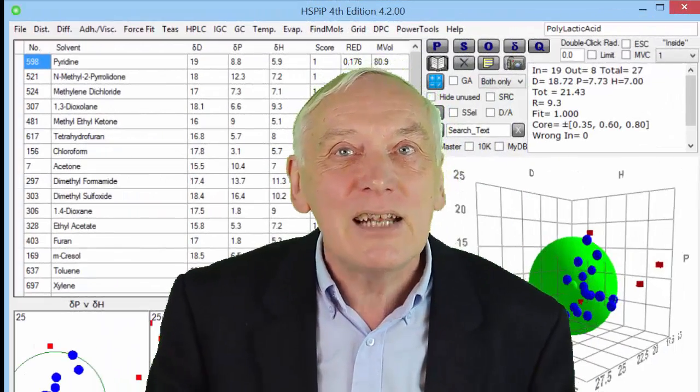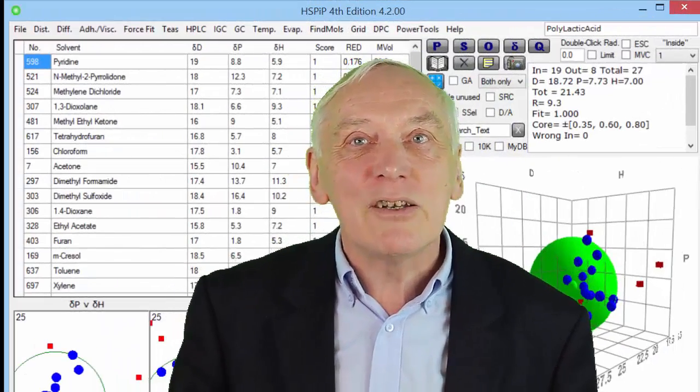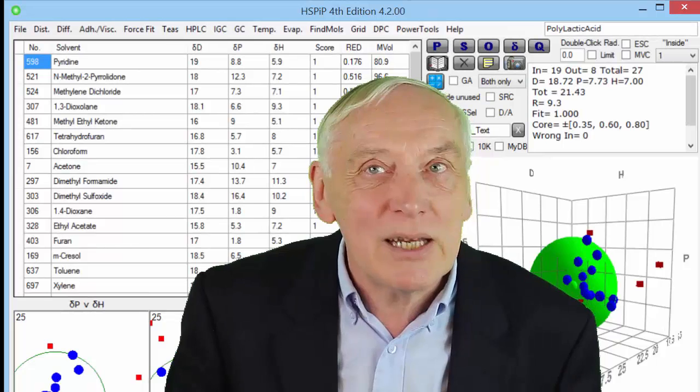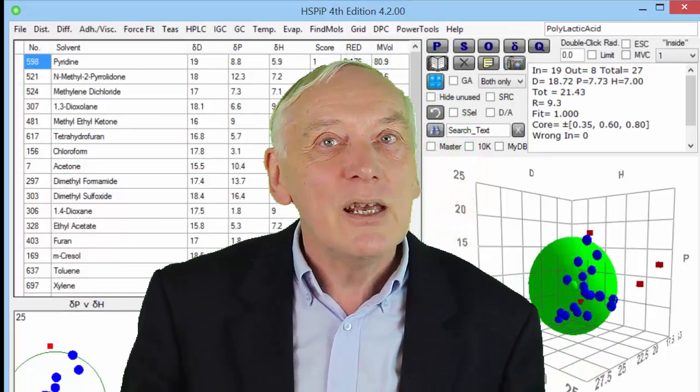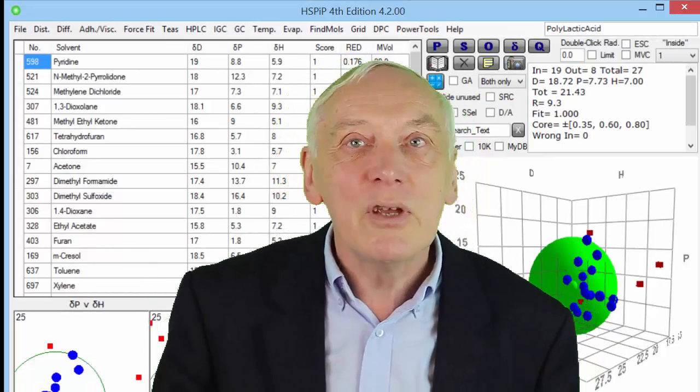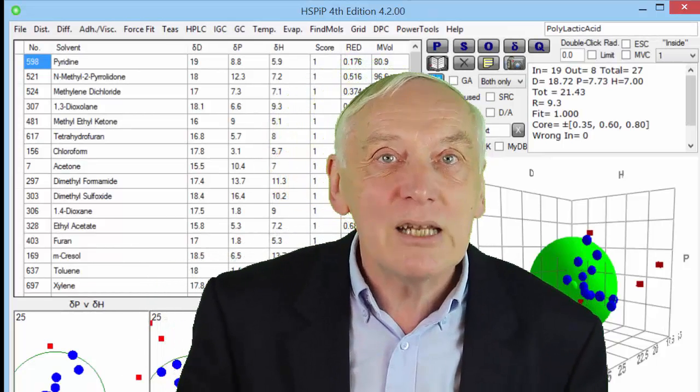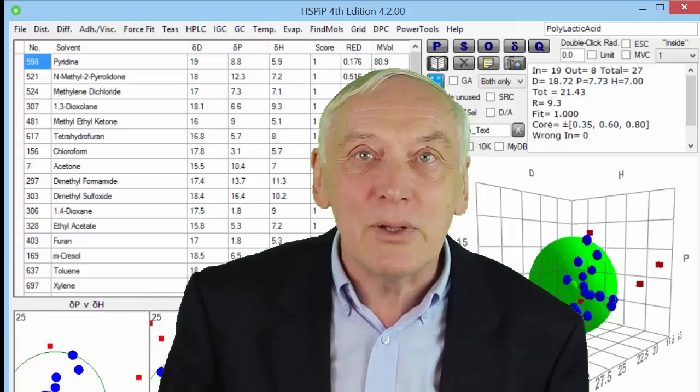In this clip, we will look at how to estimate the Hansen solubility parameters for molecules where no measured values are available.